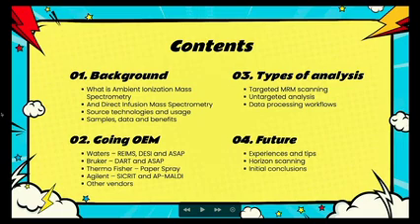I'll cover what's available from some of the key vendors as an OEM package, and talk about the sort of support that's available from those vendors. And we'll also touch a little bit on some of the homemade witch's brew type stuff that exists that you might come across in publications. As you'll discover, ambient ionization in particular is very well suited for people that like to tinker about and manufacture their own sort of sources.